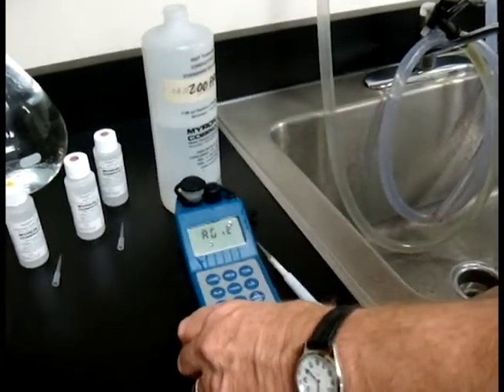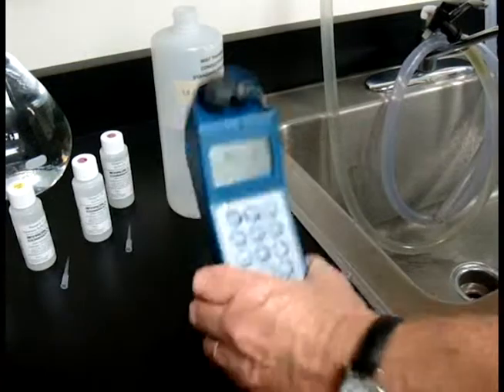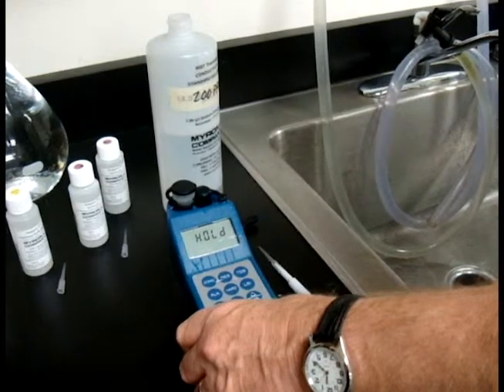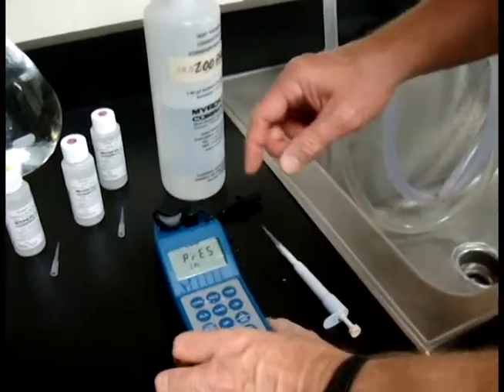Now agitate — you only need to shake it three or four times, just like that. Don't need to do a whole lot. In fact, don't shake it too hard or it'll create bubbles in there. Three or four little shakes like that is fine. It will say press Cal and open cap.